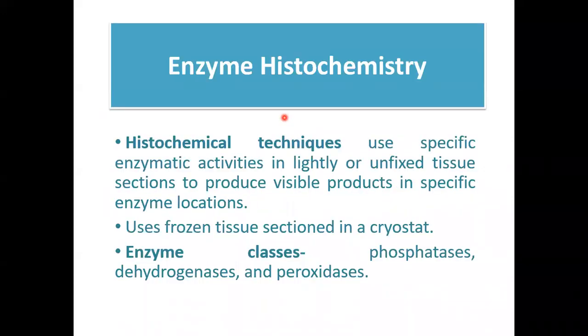Okay. So this time we have your enzyme histochemistry. Okay? So guys, here we will be discussing the method where we look into the activity of our enzymes.